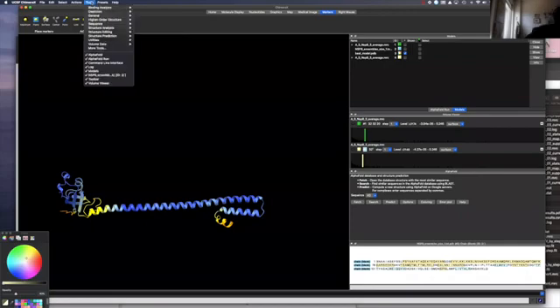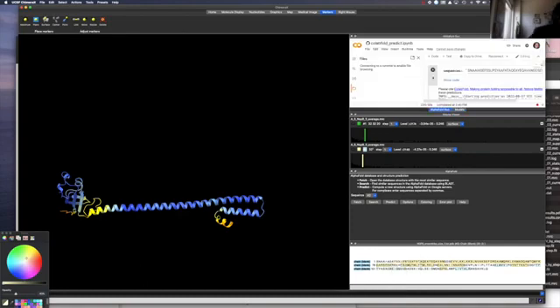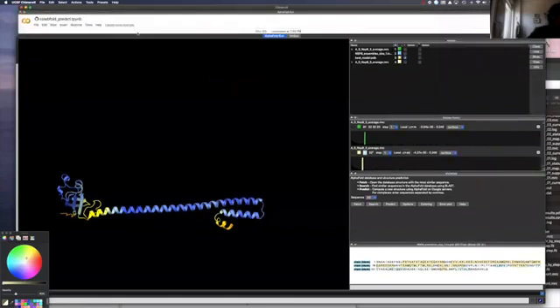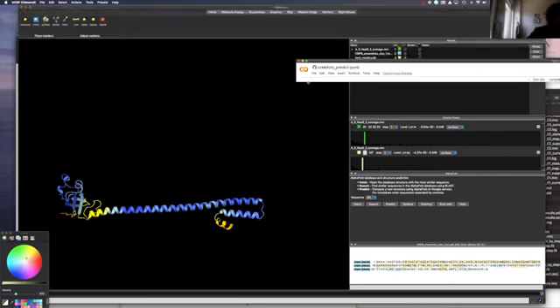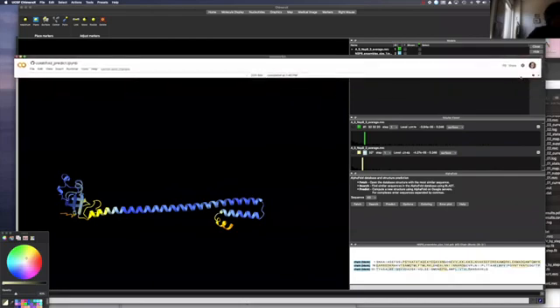So, here we go, tools. You have the possibility of selecting AlphaFold, which is directly linked. And when you have a sequence, you can go to tools here and say AlphaFold calculation. And now my AlphaFold plugin is already open. So it's right here. You basically put the sequence here. I will make this window a little bit bigger so you can see what else plugs in at different places. And it took 22 minutes.